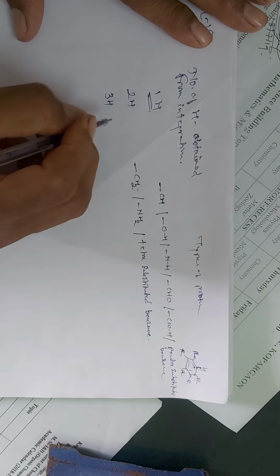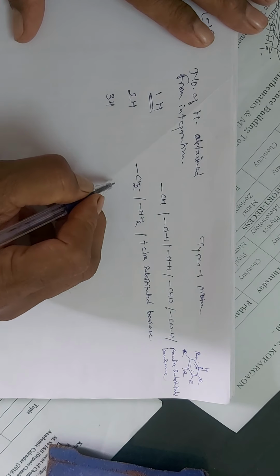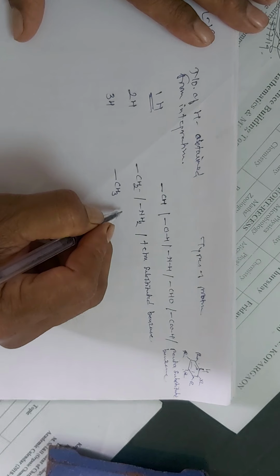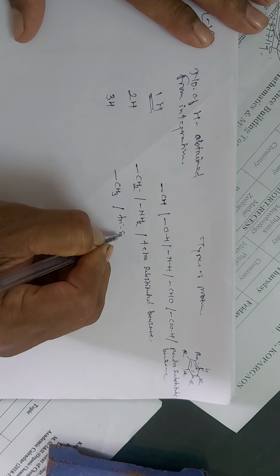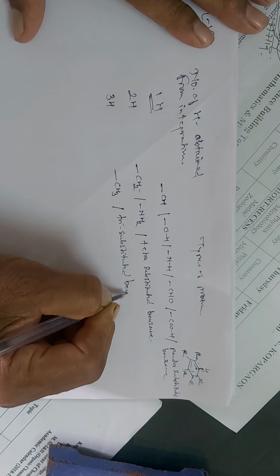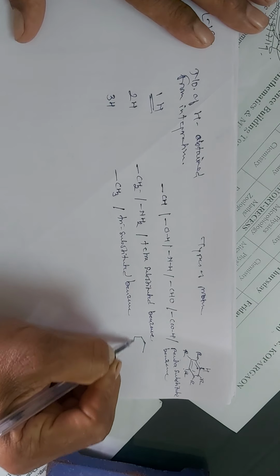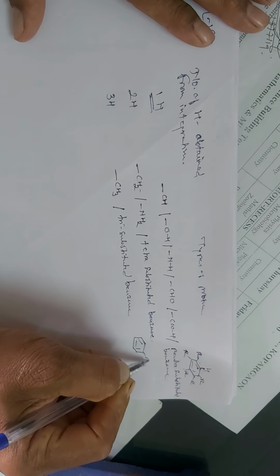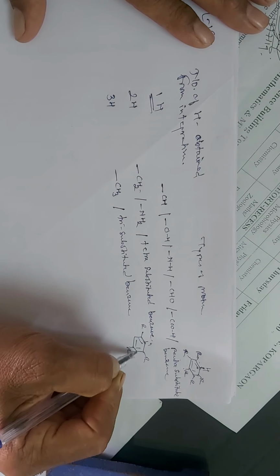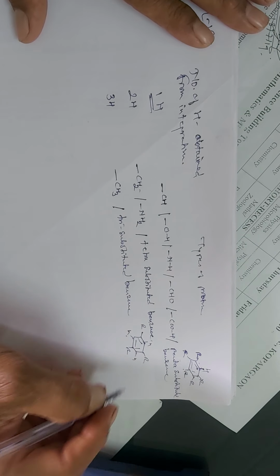Then if the integration value is obtained for three protons, then the type of group may be your CH3 group, that is the methyl group, or the tri-substituted benzene. So here there may be three substitutions. So here the three substitutions are occurring, and so here there will be three protons, and these three protons will show you the one signal.